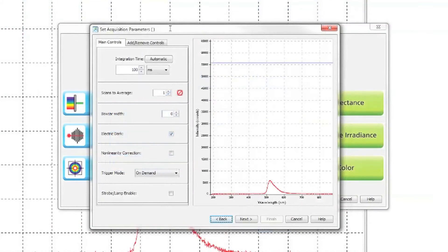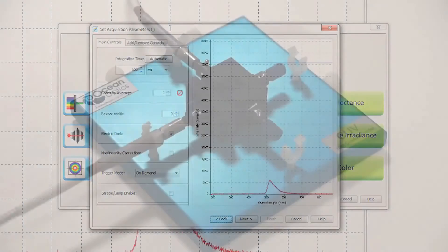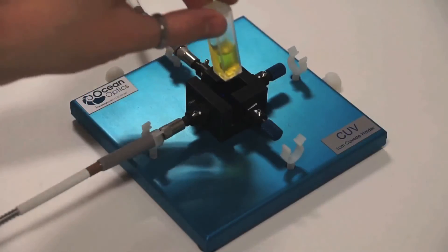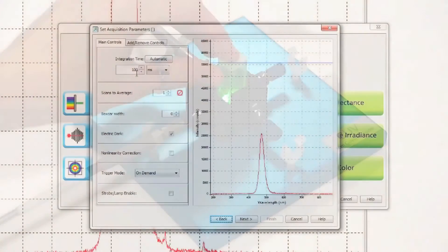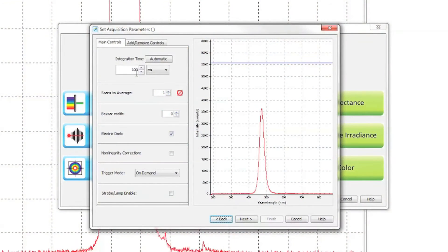You will be presented with a screen to choose various parameters. To choose a suitable integration time, insert your sample into the cuvette holder. You will want the highest point on the spectrum to reach up to about 85% of the maximum signal that your spectrometer can receive before it saturates. This is indicated by the blue line shown here.